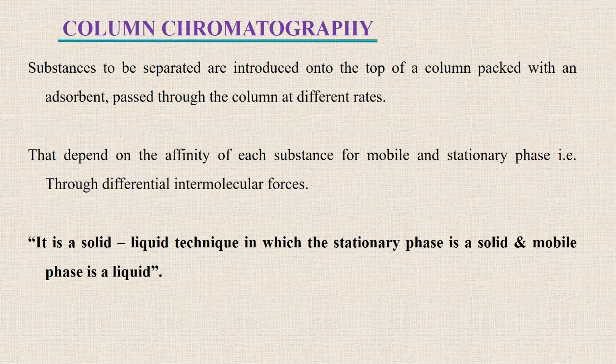The separation depends upon the affinity or attraction of each substance in a mixture. We are talking about the mixture which is to be separated, for the mobile and stationary phase. That is, different components in that mixture have different affinity or attraction for the mobile phase and stationary phase, through differential intermolecular forces. It means that the intermolecular forces between the components to be separated have different magnitudes of attraction with both these phases.